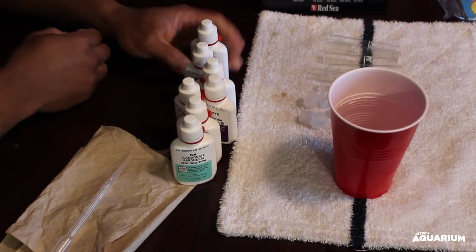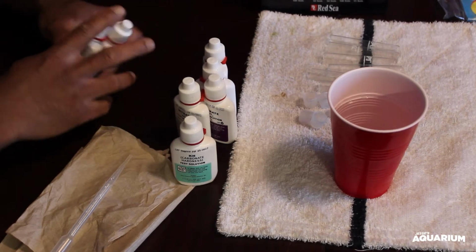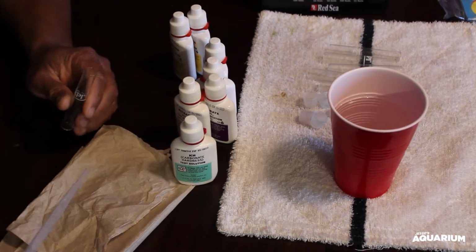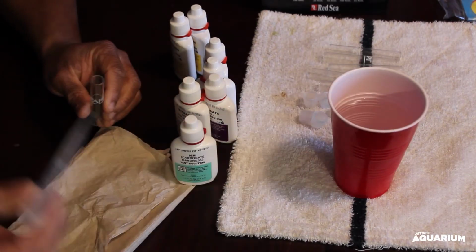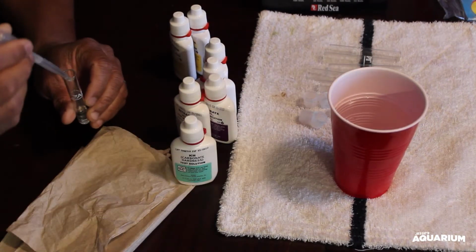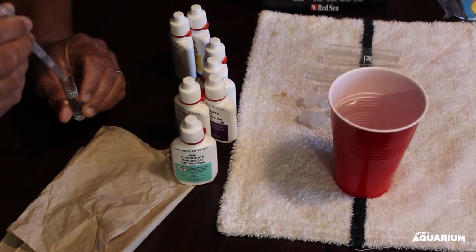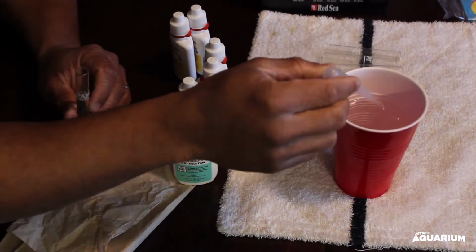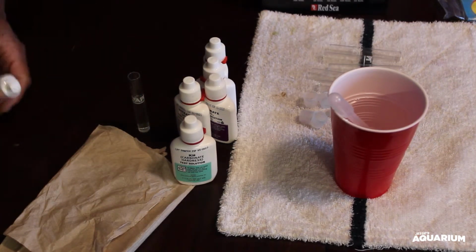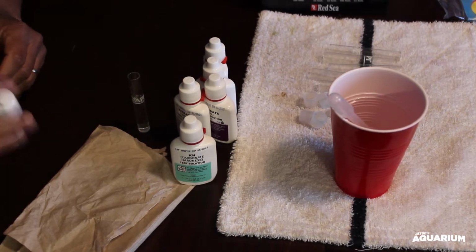So to start off, I'll go ahead and do an ammonia test to see what the readings are in there. Today is Wednesday, so it's test tank Wednesday anyway. I normally test my tank on Wednesdays and on Saturdays. Right now I've got some water that I took out of the tank, and I'm going to do the first test with the ammonia, and let's see what the readings will be.